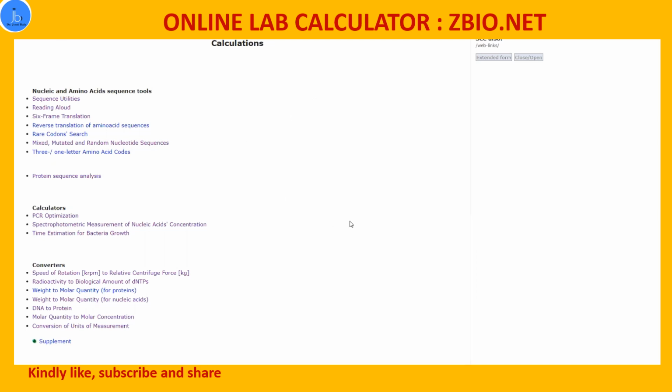So in a laboratory, we do a lot of tasks related to nucleic acid and protein. Like sometimes we have to read our sequence, oligonucleotide. We have to convert the lower cases to upper cases. Sometimes we have to convert to the complementary strand, the sense strand. We have to get the ideas about 5' to 3', and then we sometimes have to convert them into the complementary strand, depending on what kind of projects we are handling. Maybe you are doing PCRs and cloning.